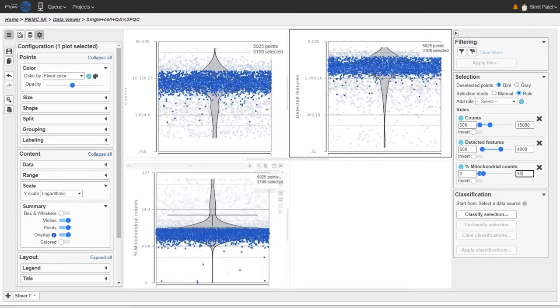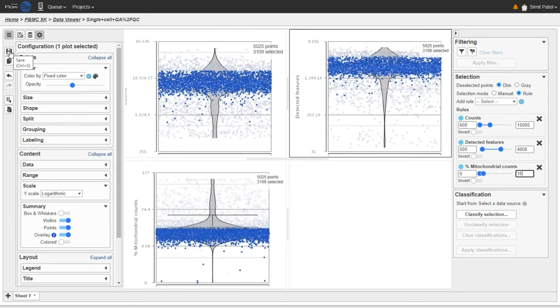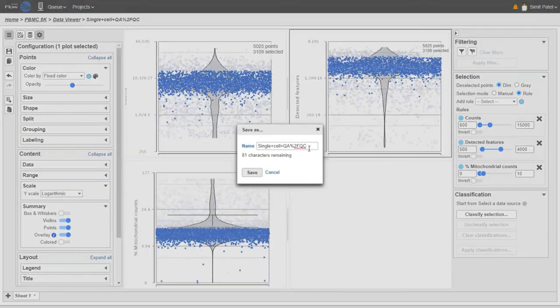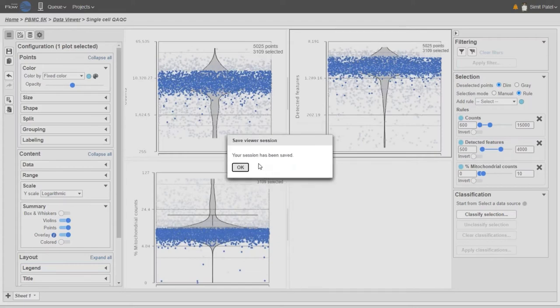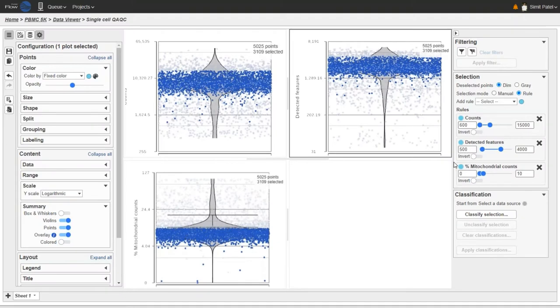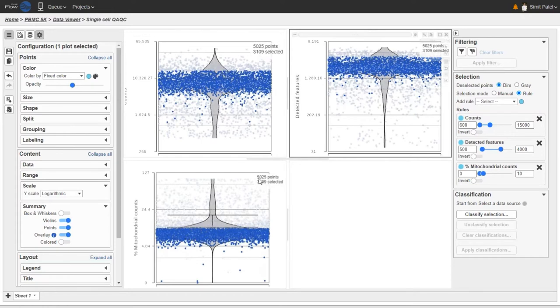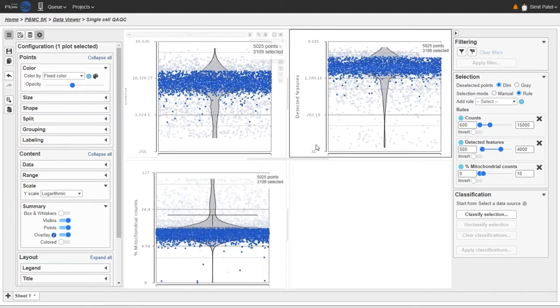Once you're happy with your set of selection filters, this is a good time to save the data viewer session by clicking the Save icon on the left-hand side. I'll give it the name 'single cell QA/QC' and click Save. This helps us remember the selection criteria we used, and if we need to go back and redo the filtering we can do that very easily. Saving the session saves all three plots with all their configuration settings, so we don't have to redo all this configuration again next time.